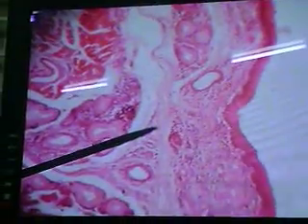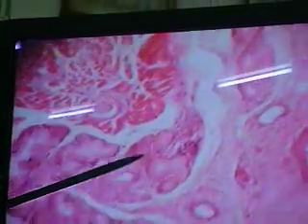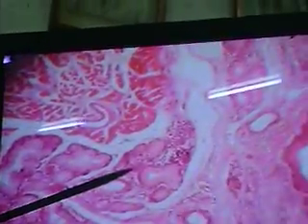To really say that's lamina propria and that's submucosa, because as we said, there's an absence of a muscularis mucosae. The glandular tissue, the glands of the pharynx, the pharyngeal glands, these are found deeper within. And these glands, we said, tend to pass between what? The muscle bundles.